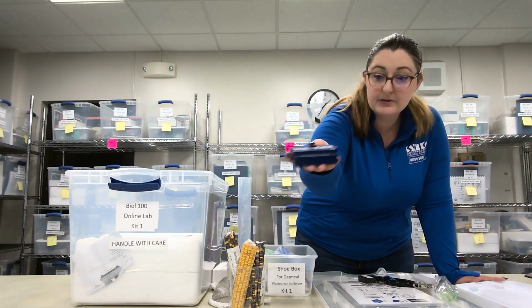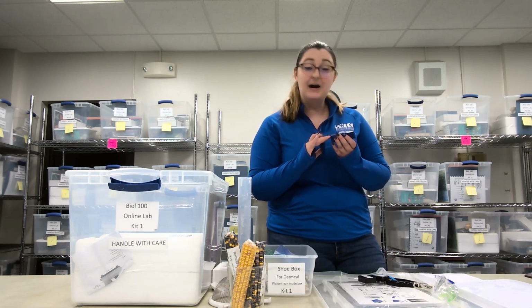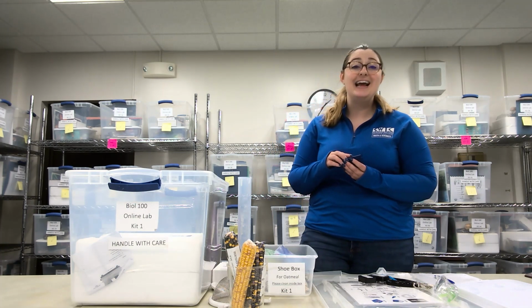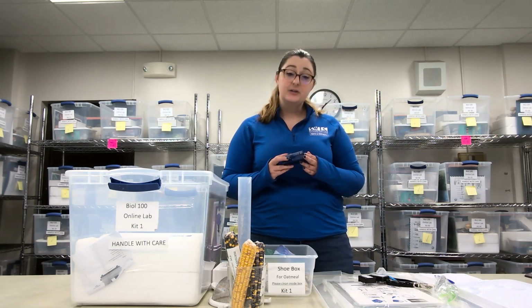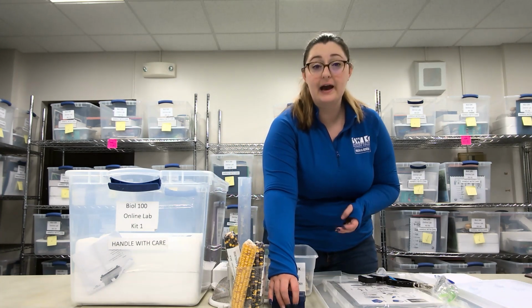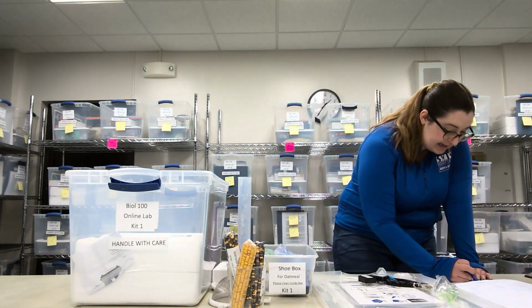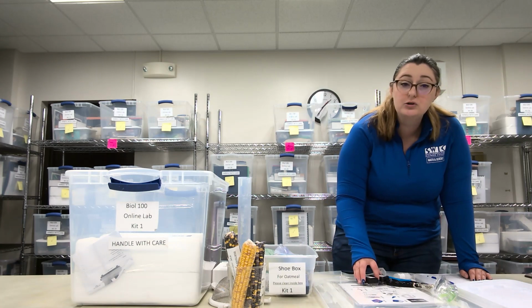It looks like this, pretty blue. Take off the lid. You'll notice on the inside it tells you everything that this little box should have. Go ahead and count your slides. You should have 8 slides. If you do not have 8 slides, we need to figure out which one you are missing. So if you are missing a slide, go ahead and set your box to the side and we will figure that out after the video. But if you have all 8 slides, go ahead, put that gently into the shoebox and you are good to go. We'll come back to the list and check off that we have everything that we need with the blue slide box.